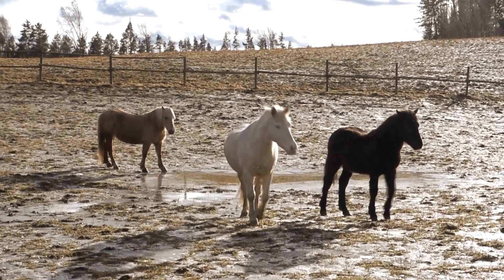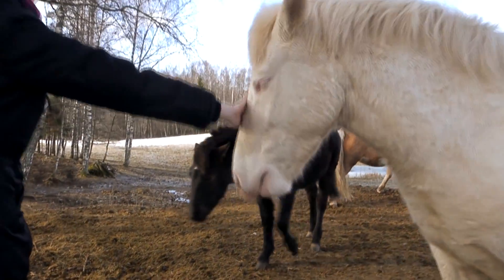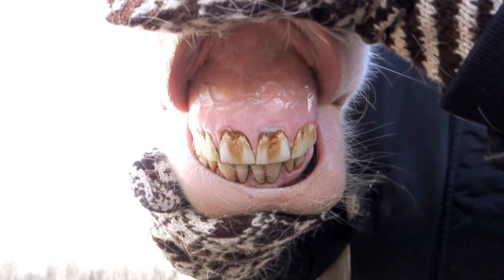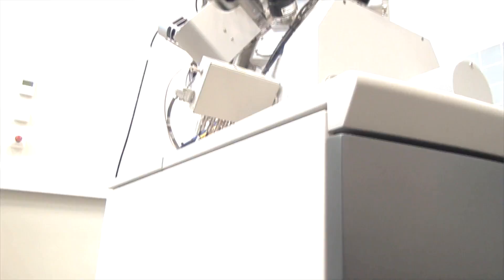Have you ever heard someone say that you shouldn't look a gift horse in the mouth? It means you shouldn't be ungrateful when you receive a gift. But what secrets lie hidden in the mouth of this majestic creature? Let us find out by studying a tooth of a horse under the scanning electron microscope.